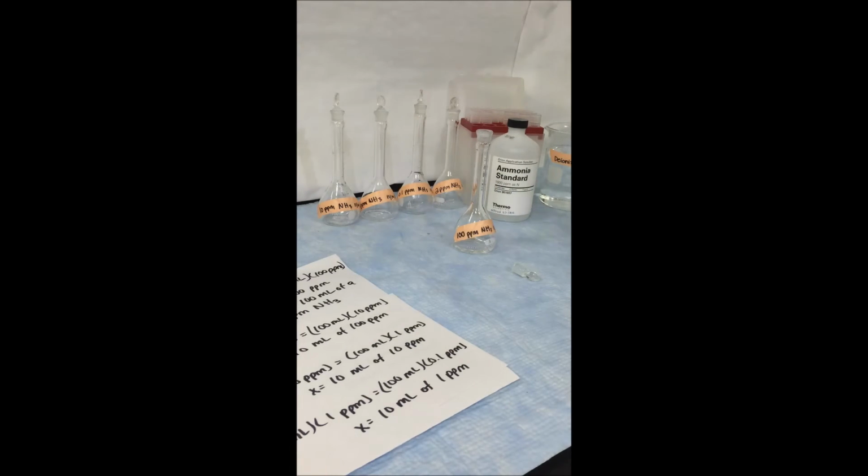Then, using fresh deionized or pure water, we are going to fill the flask all the way to the volumetric line. You want to make sure that the bottom of the meniscus is touching the line so that you truly have 100 milliliters of solution.